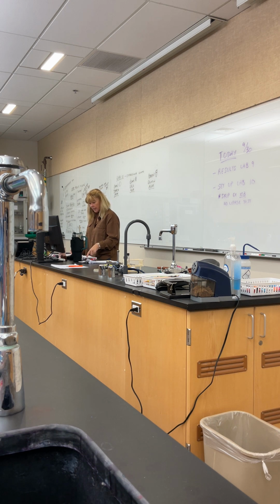For Staph aureus, is growth present? We said yes. So now we're gonna write what color was the colony. So what color was Staph aureus? Yellow, excellent. So we'll write yellow in there. What color was Staph epi? He was white/pink, right? Because he didn't change the media, so white, pink. Then it says record your gram reactions. Well, we just did that on the board. We know if it didn't grow, it has to be a gram negative. So we'll put gram negative for E. coli and Proteus. And for the Staph aureus and Staph epi, they are gram positive. So that's what we're going to be doing for all of your media. All right? Okay, so those are our results.